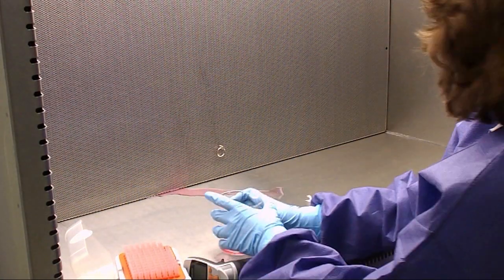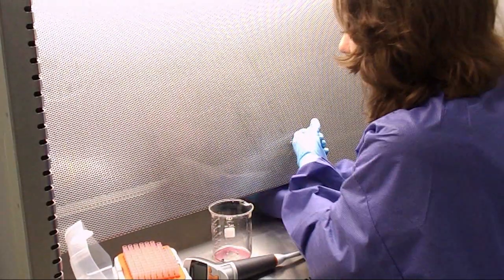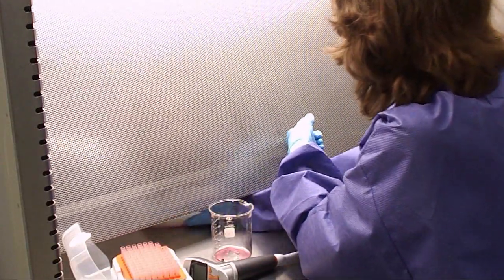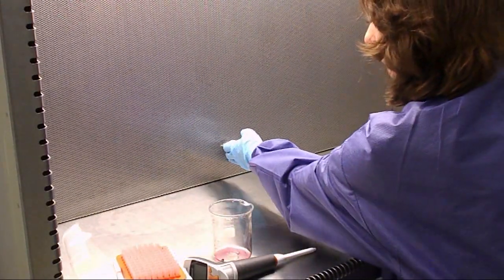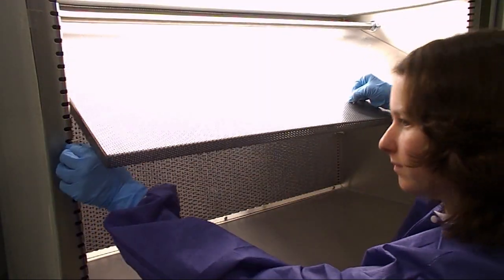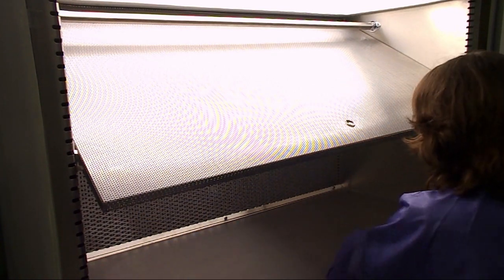The diffuser option is easy to install on your existing EdgeGuard HF clean bench and still provides easy access for cleaning. Simply lift the diffuser to wipe small spills. For more thorough disinfection, the diffuser easily latches to the front of the clean bench, giving you full access to the entire work surface.